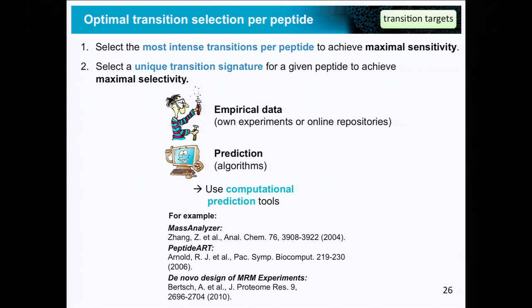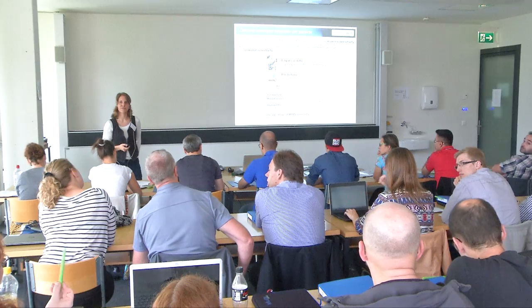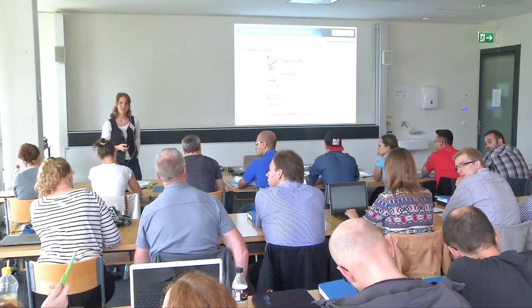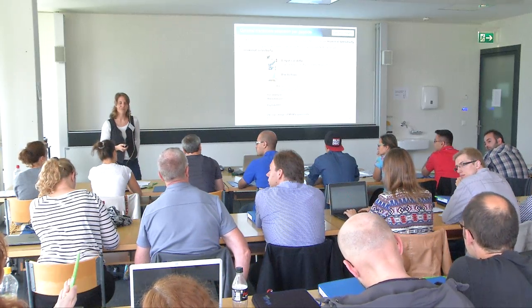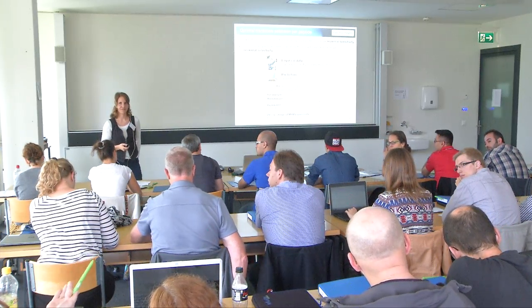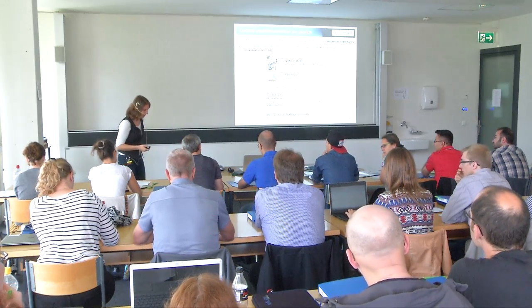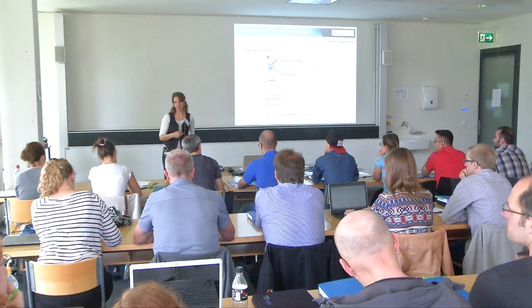Yeah? Sorry, for your own data, there was a discussion or maybe some hints in the literature that maybe HCD data are more suited to predict best transitions than CID data. Do you have any experience on that? Well, we didn't do a big survey of this ourselves.